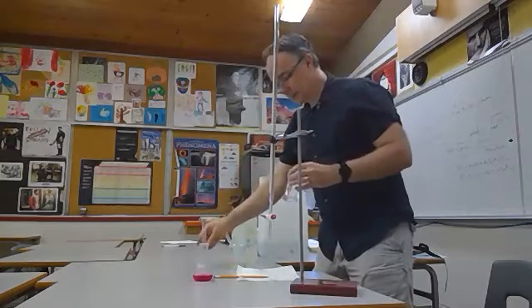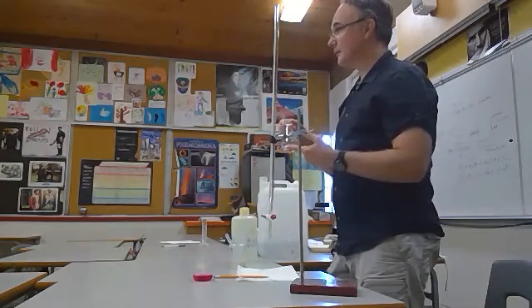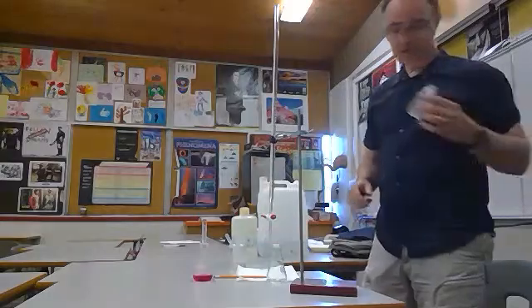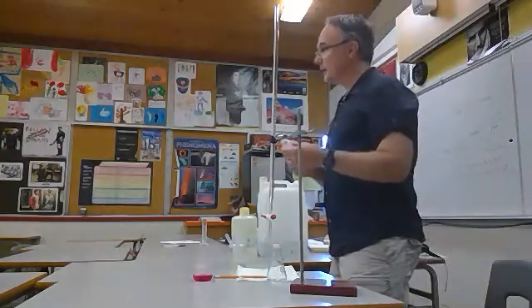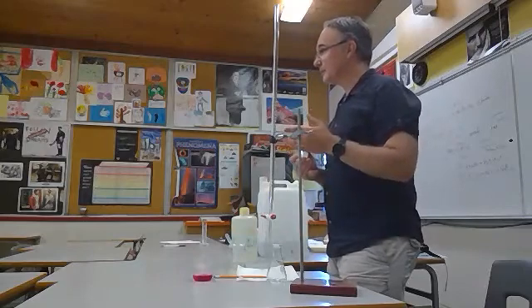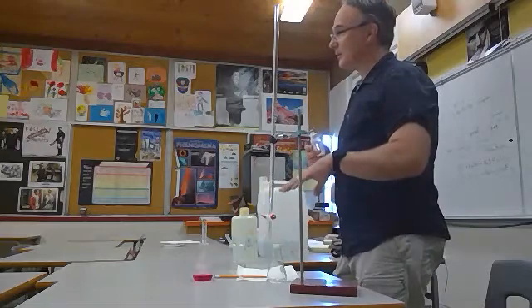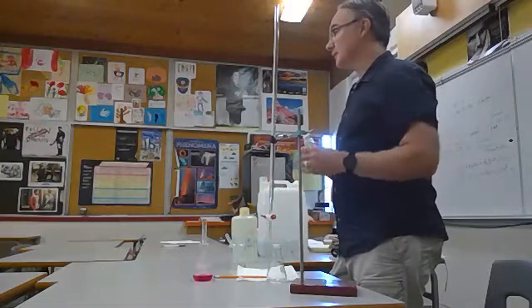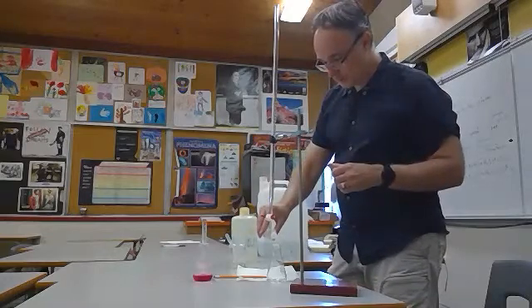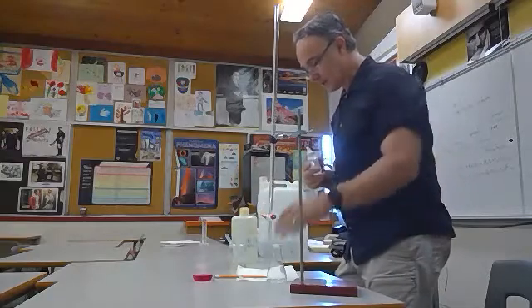Right now the pH here should be well below 7. It's an acid. And what I'm going to do now is add phenolphthalein, which is our indicator, and its pH range is from about 8 to 10 roughly. So if I add this here, it should be below 8, which is colorless. There's just no color to it. So a few drops. Swirl it around, just mix it in.